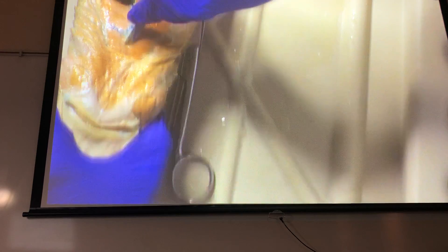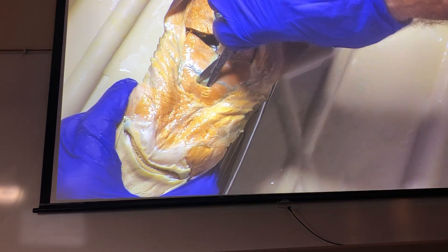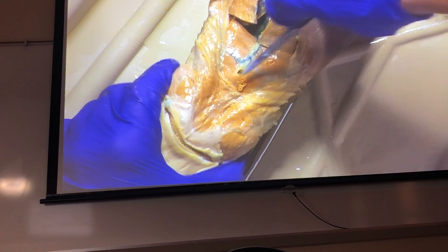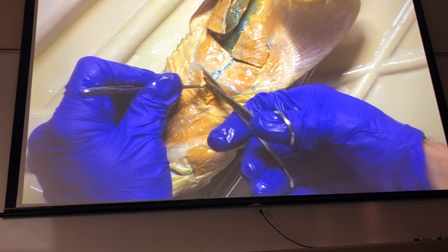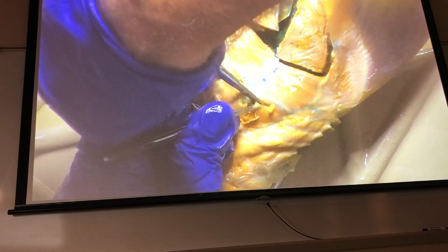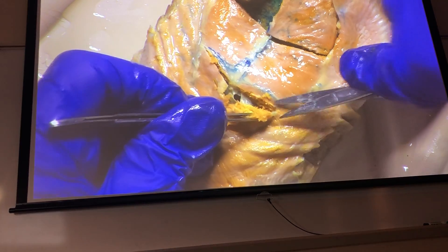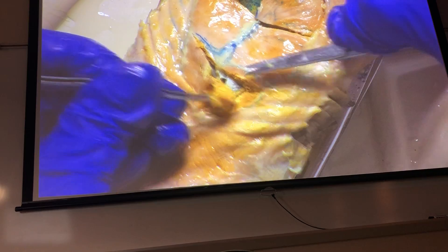We're going to come between the two coracoid curals, stick our scissors in right above the coracoid bar and open up. Come right up to the intermandibularis. We're going to cut along the coracoid bar so this kind of opens like French doors. You can see that white membrane of the pericardium I'm cutting into, and again we don't care about the common coracoid curals anymore so we just remove them.